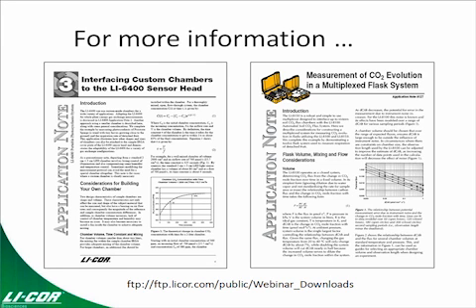Well, the problem with that nickel-plated aluminum, Jason, is you're not going to get a whole lot of light penetration. So a chamber made out of nickel-plated aluminum is not going to be the best thing for measuring plants. But you're absolutely right. That nickel-plated aluminum is actually what we use on most 6400 chambers, but you have to have some sort of clear orifice to let light in if you're going to be going that route.